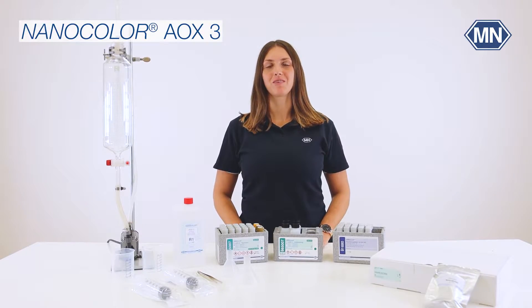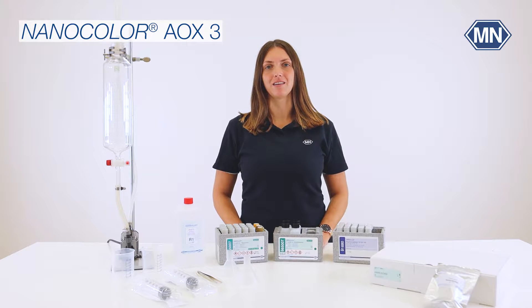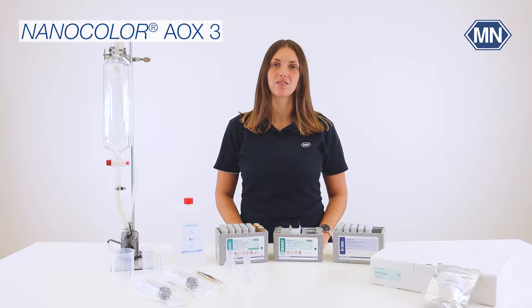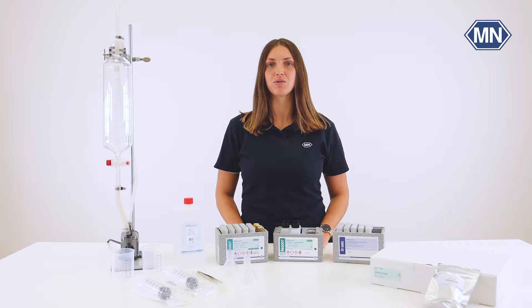Hello and welcome to the YouTube channel of Macherey-Nagel. My name is Lisa. I'm product specialist at Macherey-Nagel. Together with our research and development team, I will show you how to perform the NanoColor AOX test for the determination of absorbable organic halogens. This video is about the automated extraction with our pump set.